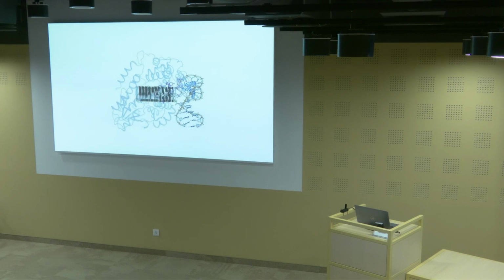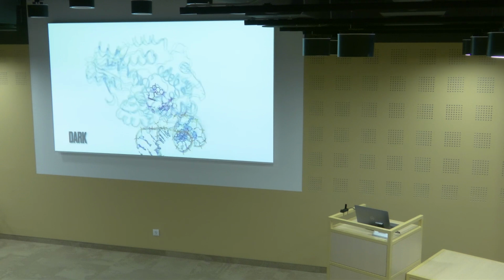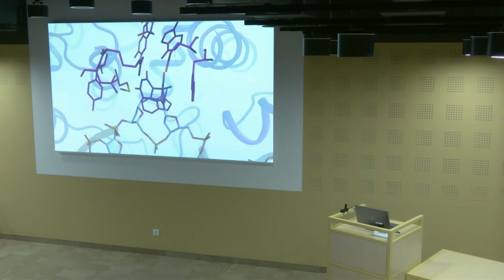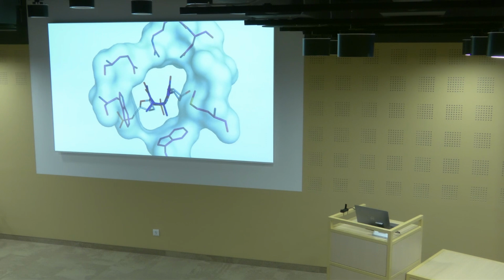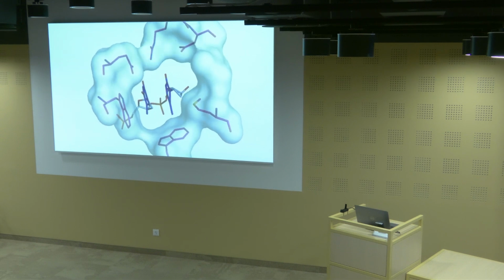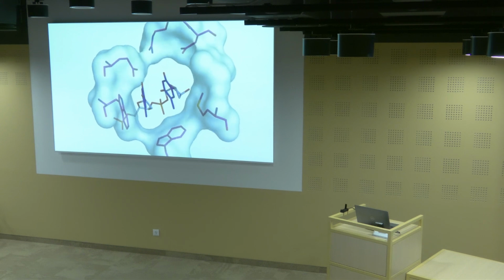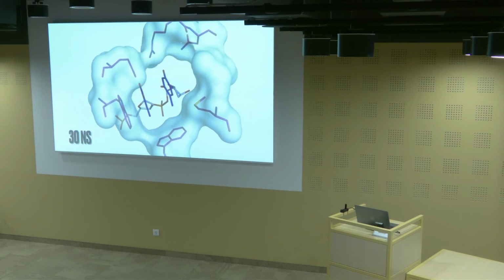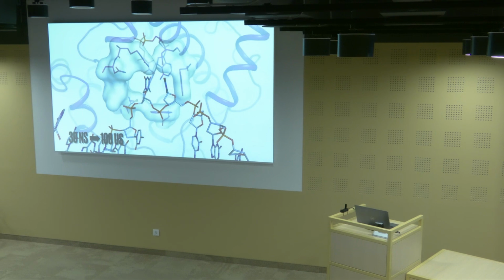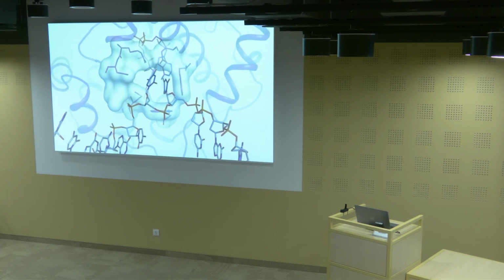And then we can look at the final question that we were interested in, which was product release. So what happens at the longest time scales that we've probed? And what can it tell us about how the enzyme discriminates that substrate from a product? So here we rotated back around to look outward from the active site pocket. And we can see the restoration of the thymine systems. And they actually dwell in this pocket for quite some time. But what we can see is that at long time scales, first we have ejection of this thymine and then this thymine.